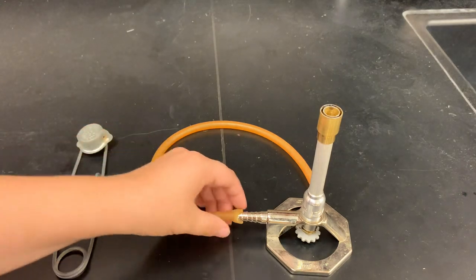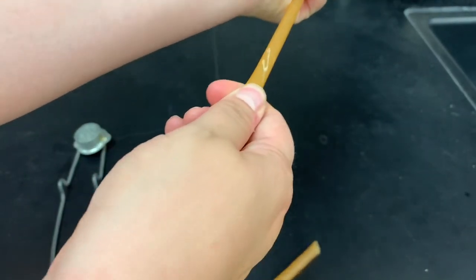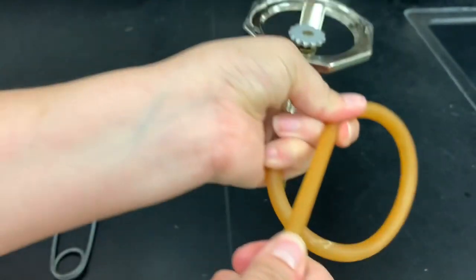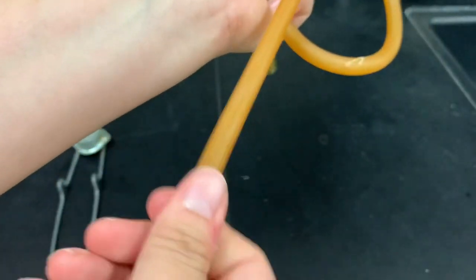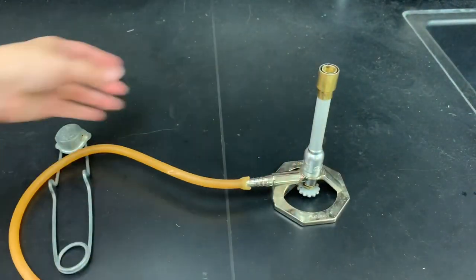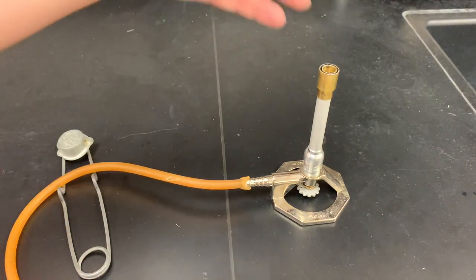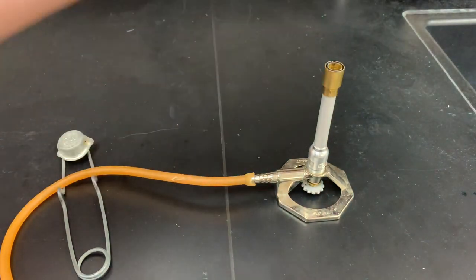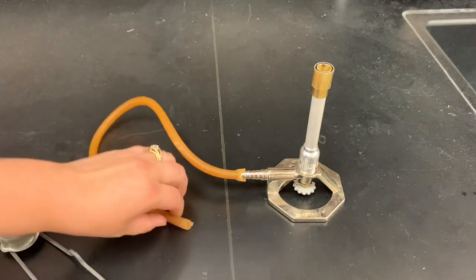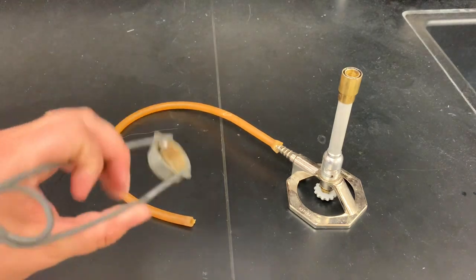Before doing any work with the Bunsen burner, it's very important to check your hose to make sure there aren't any cracks or holes. The hoses are made of rubber, and rubber cracks over time. This is really important because the gas is flammable — if gas leaks out of a hole in the tubing, it can be ignited by the flame and you can end up with a fire going all the way down the rubber tubing. Always check that your gas is flowing through a tube with no holes.